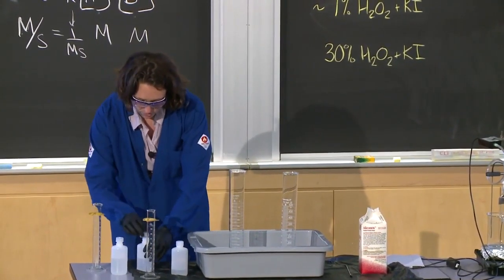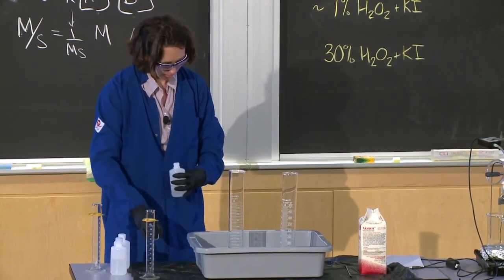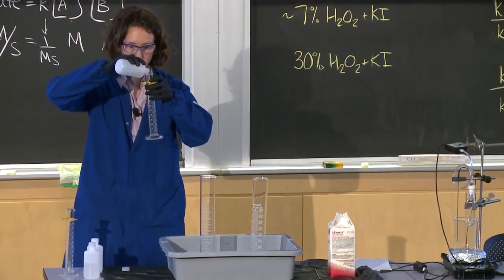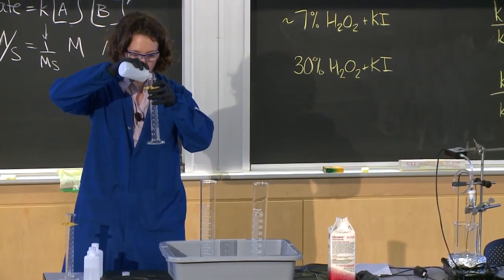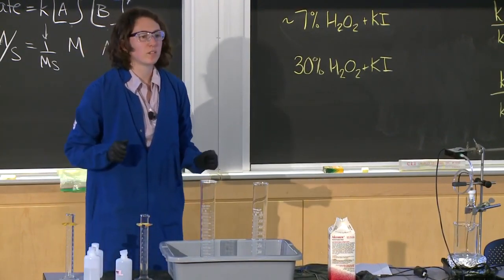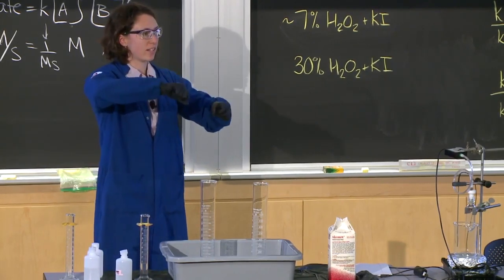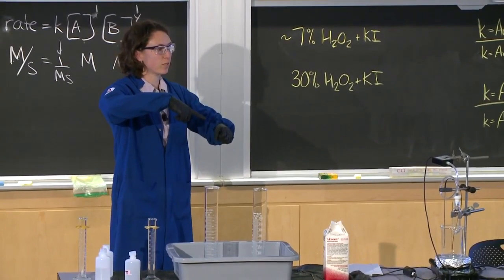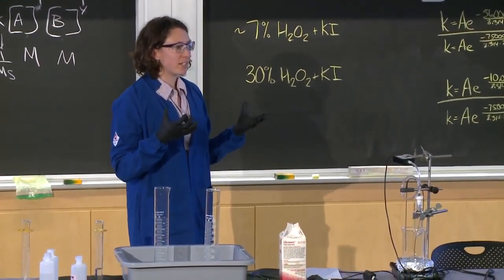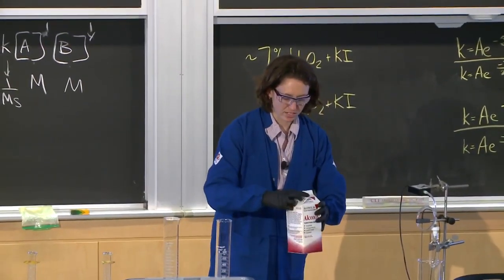And then we want to use this potassium iodide solution. So we can pour some of this in here. And then we have the oxygen bubbles. Who did the catalase reaction yesterday in lab? Anybody who's here? So what did you see when you added the enzyme to your peroxide in the tube? Bubbles. Good. But it didn't foam up, right? Because they just popped and formed oxygen. So the way that we can get this to foam is by adding some soap.